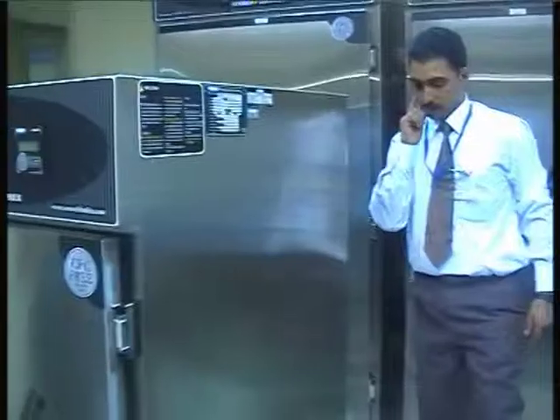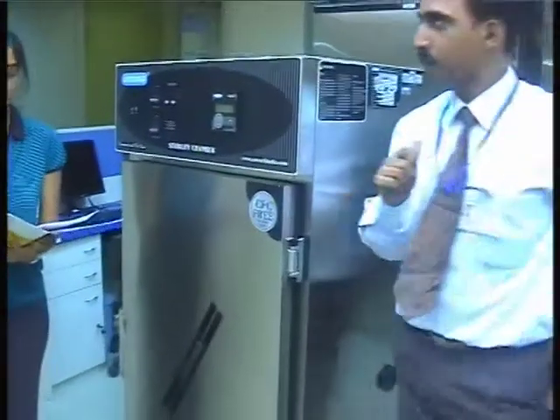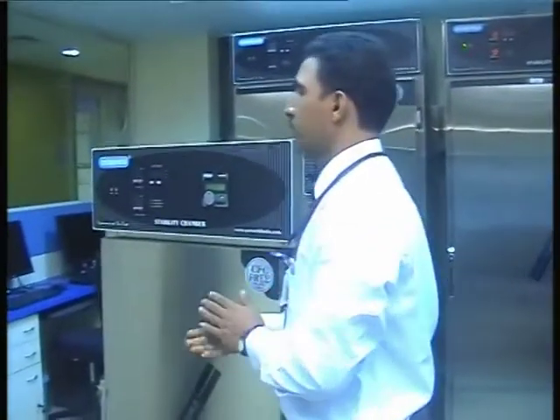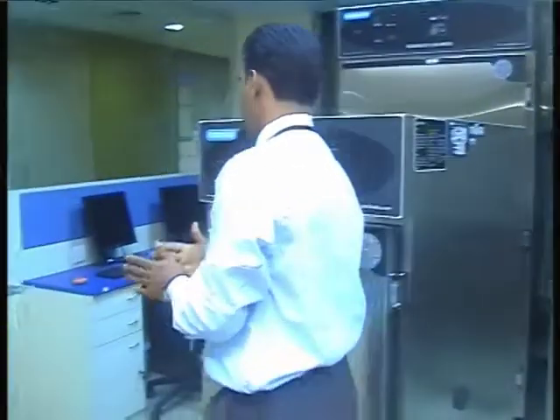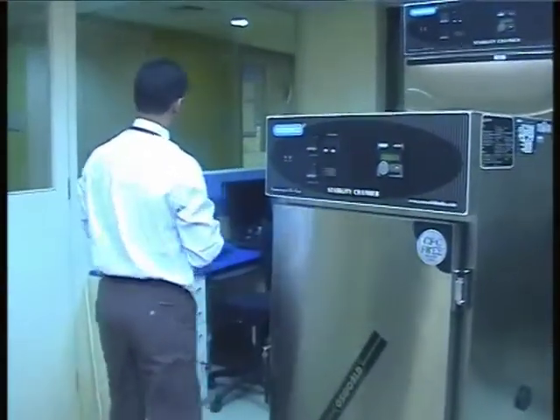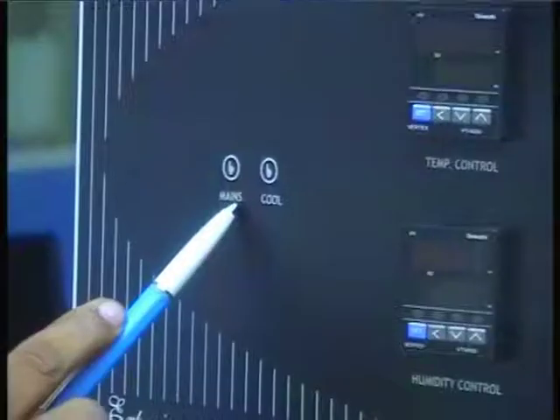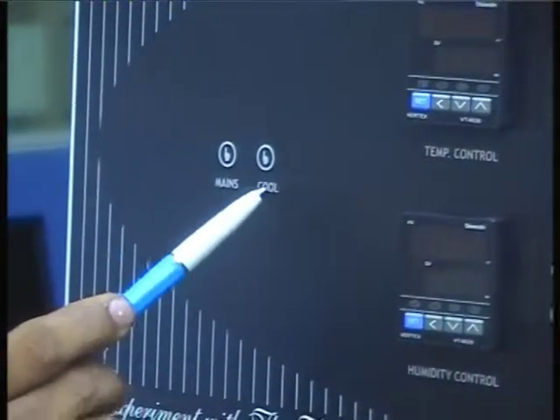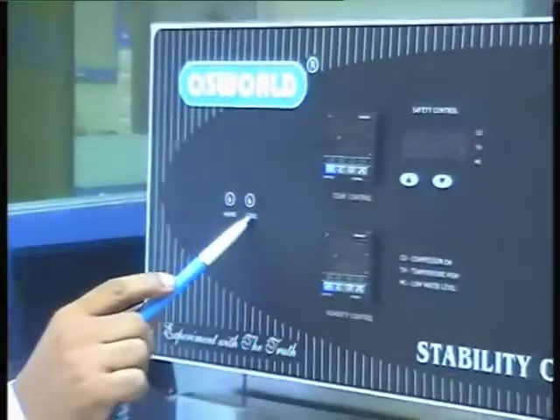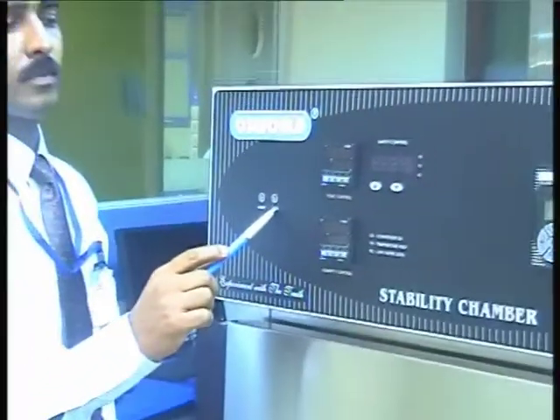I will now explain the manner of setting some of the individual components which are a part of the Oswald stability chamber. The cool switch is used to switch the cooling system on and off.